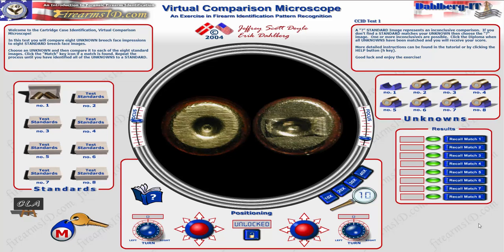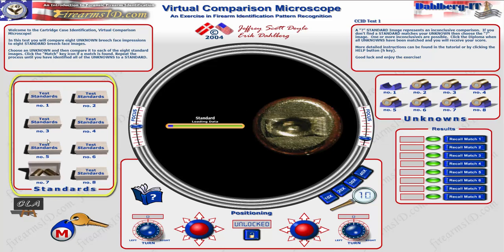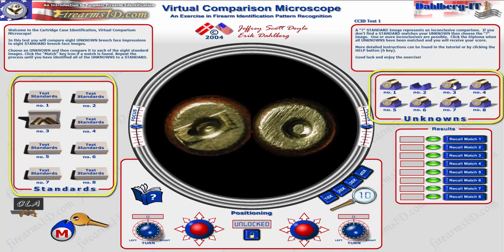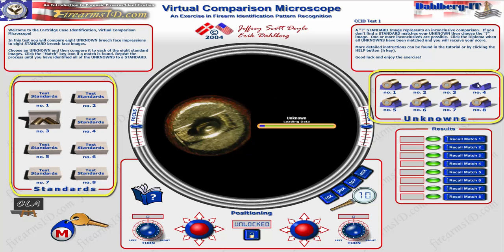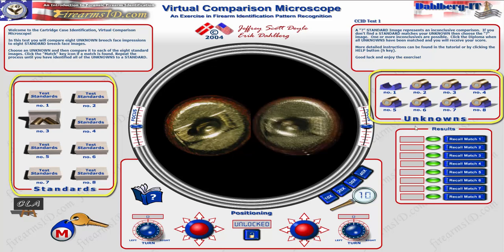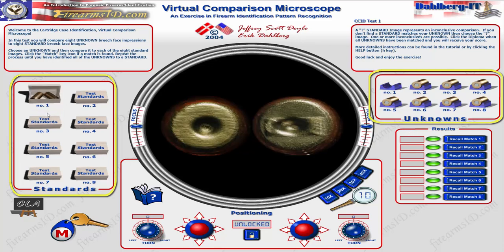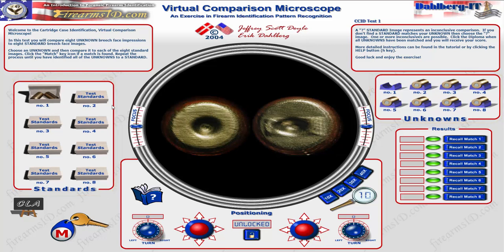Welcome to the Virtual Comparison Microscope CCID Test Number 1, or the Cartridge Case Identification Test Number 1. What we're doing is comparing cartridge casings from standards, which you can see over here, as well as unknown cartridge case sources. Perhaps these were found at the crime scene and we have some standards — some suspect weapons — we're trying to compare them to.